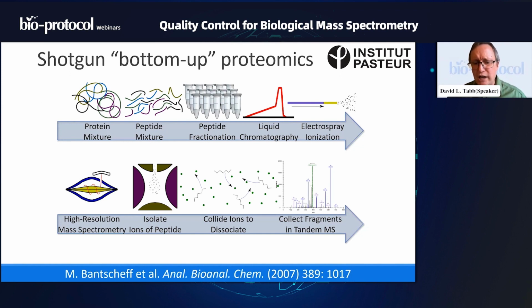Now, I've drawn a green line in that tandem mass spectrum over at the right, and that was not a mistake. That green line at the lower right part of the diagram is to indicate that we know the mass to charge of the ions we destroyed to create this tandem mass spectrum. So we're going to keep track of which fragments belong to which precursor ion, which intact peptide ion.